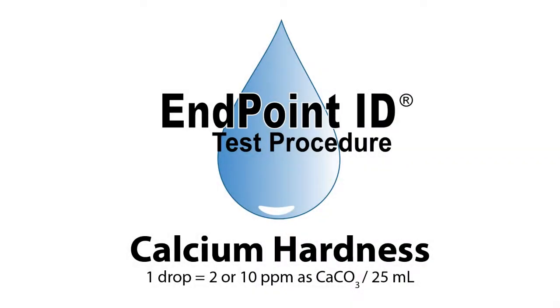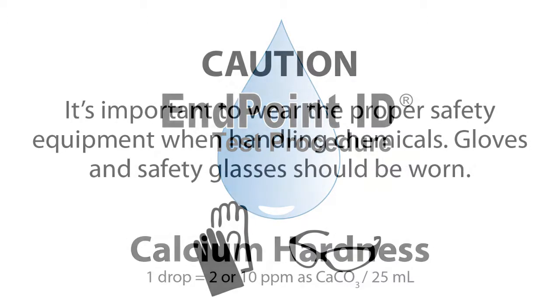This is a demonstration of a calcium hardness drop count test kit using endpoint ID procedures.